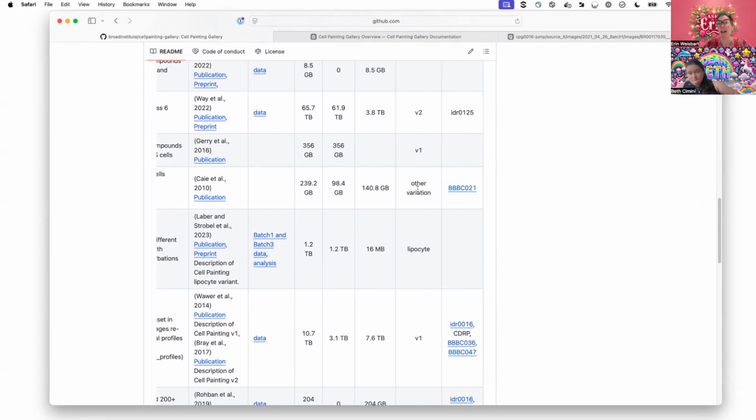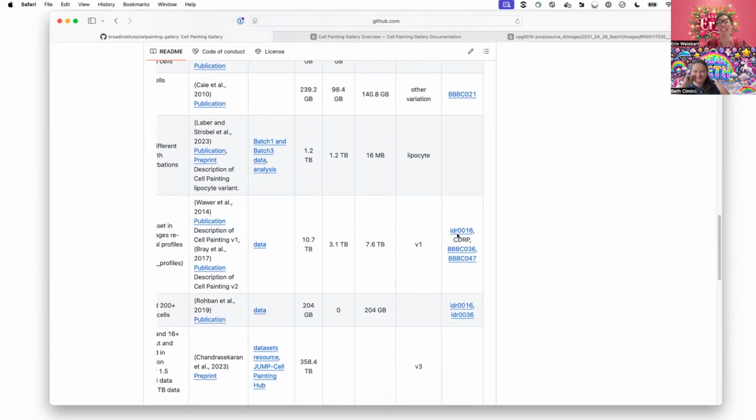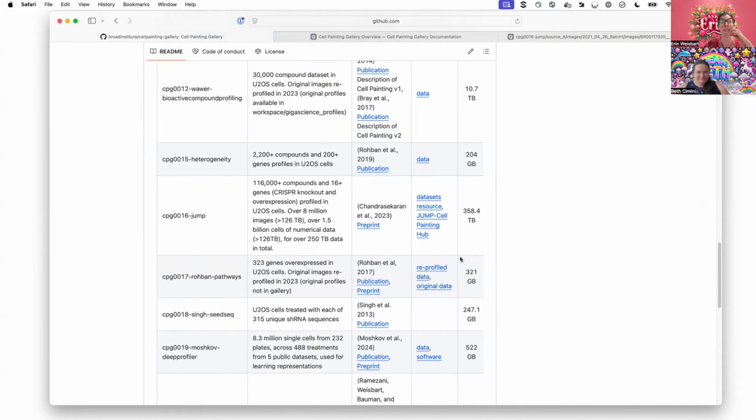So you may recognize data sets from BBBC, the Broad Bioimage Benchmark Collection. You may recognize it from the IDR, which we have another Ask Erin Dear Beth episode about, one of our first episodes, and how much we love it. We do have data in IDR as well, so that's something to bear in mind.